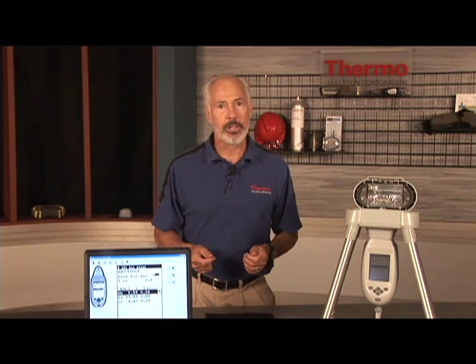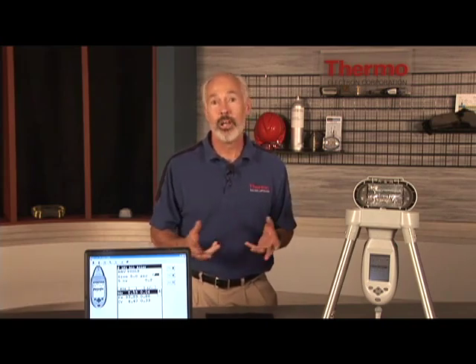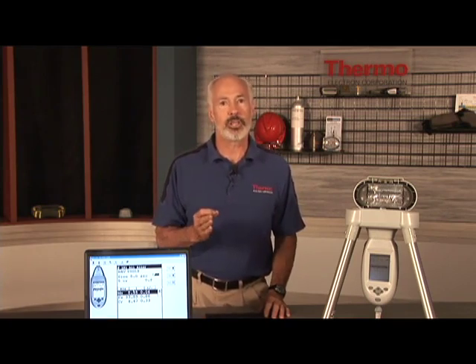The petrochemical industry must be able to accomplish this difficult alloy separation in order to have absolute confidence that the correct alloy grade is applied to the intended use. A standard alloy analyzer requires longer measurement time to obtain enough statistical confidence or precision to correctly make this identification.